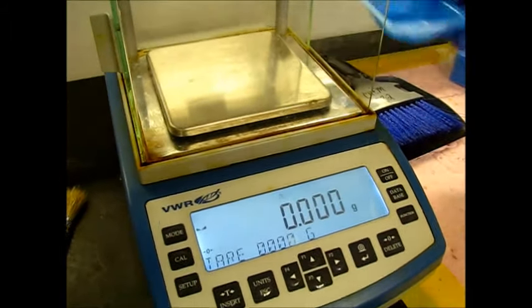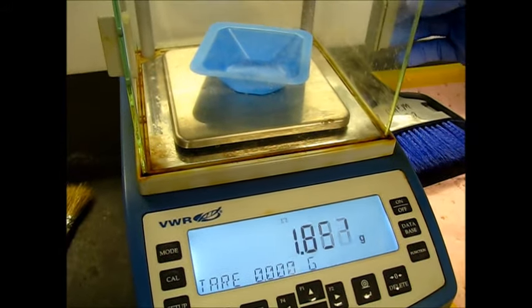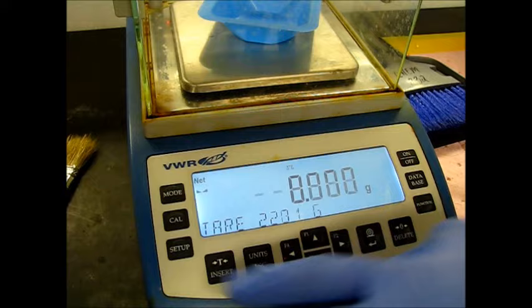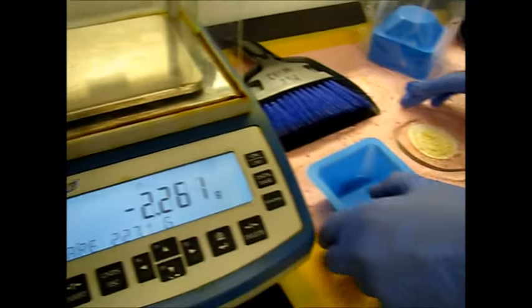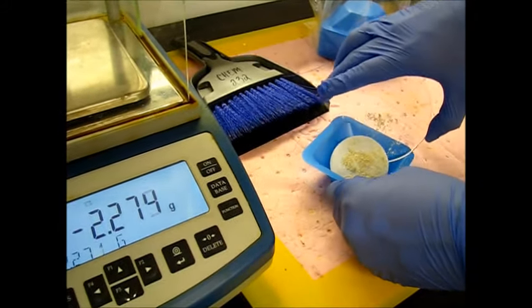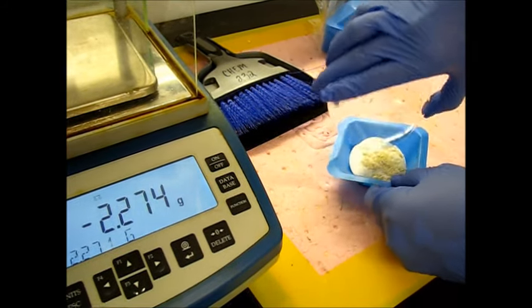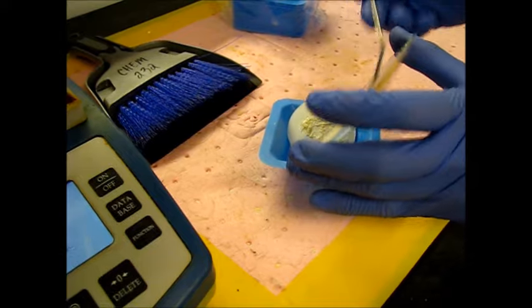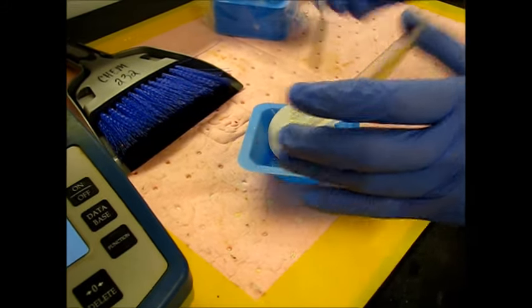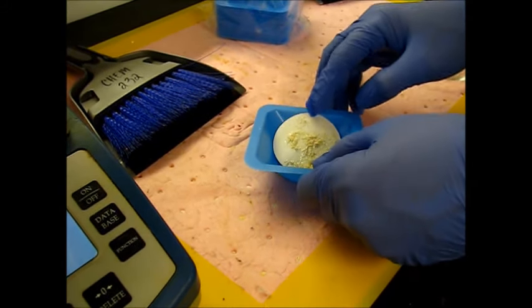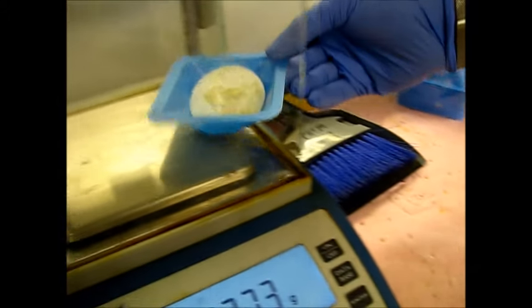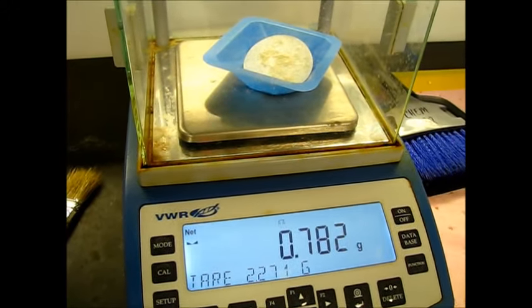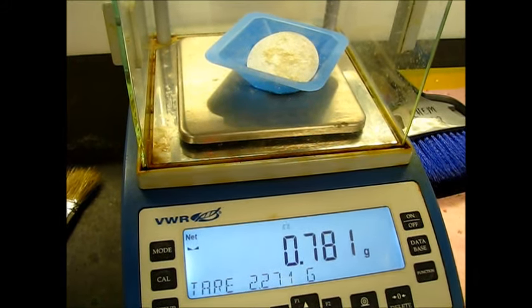So we're going to go ahead and get the mass of our product now that it's out of the oven. So we're going to tare the weighboat first. And then we're going to add everything in here. So 0.781. Cool.